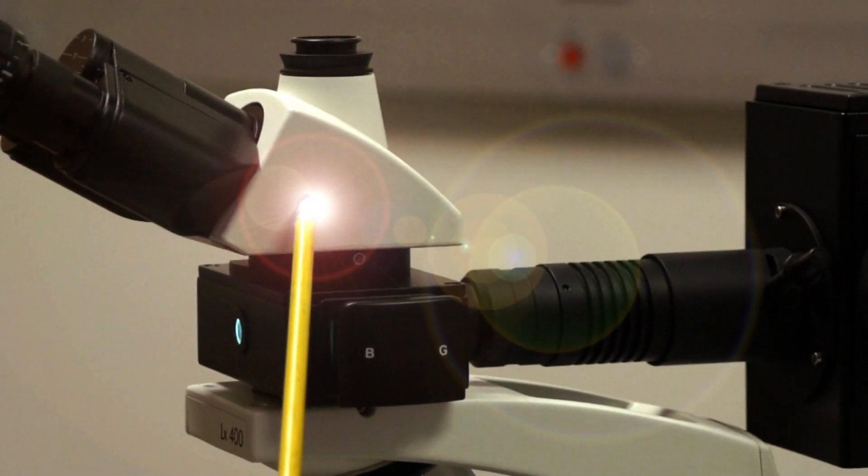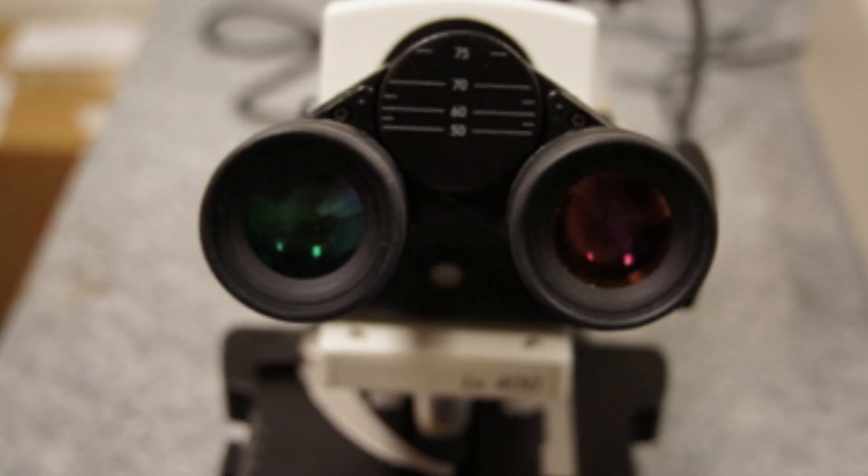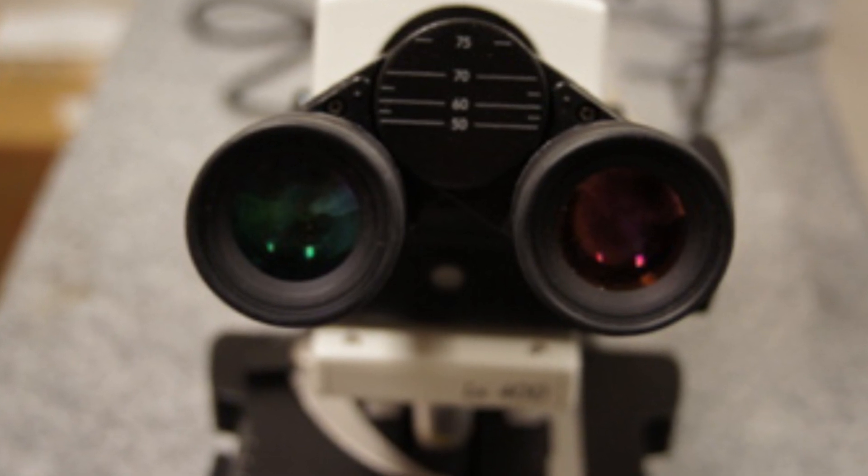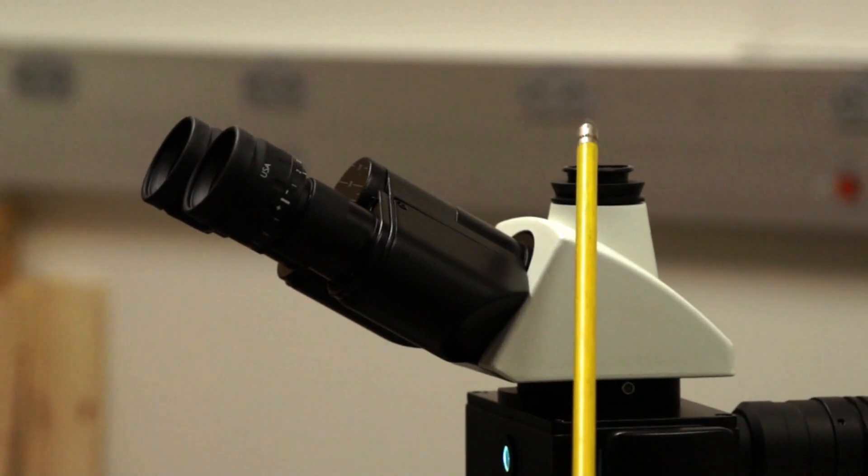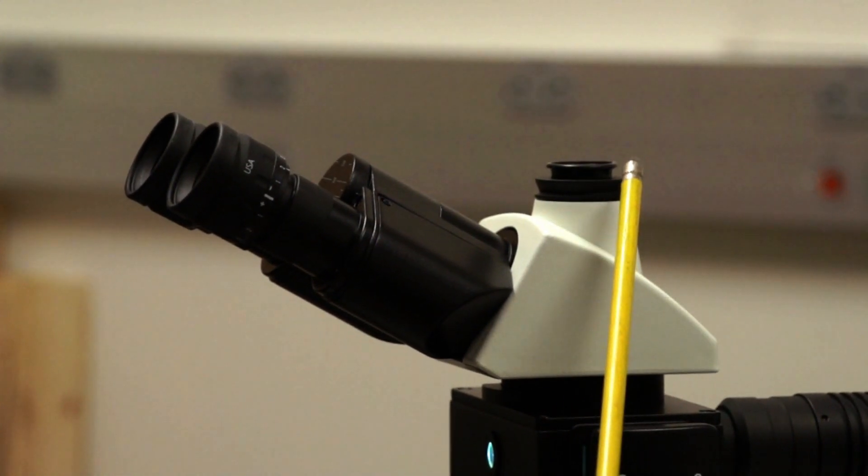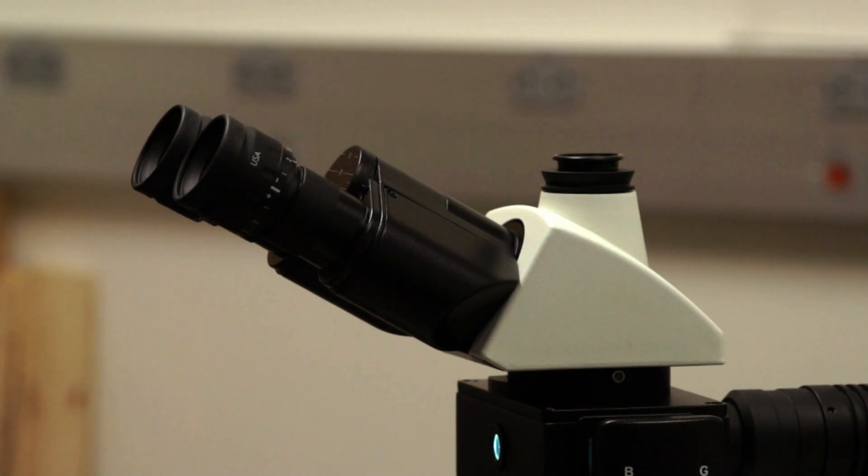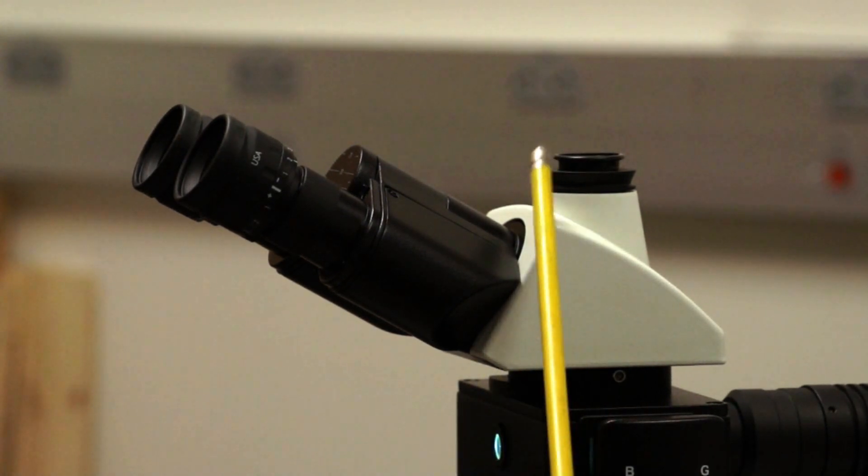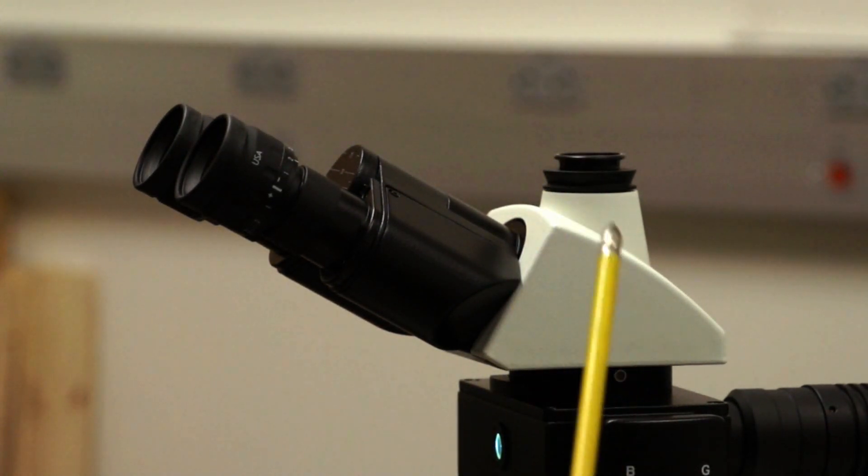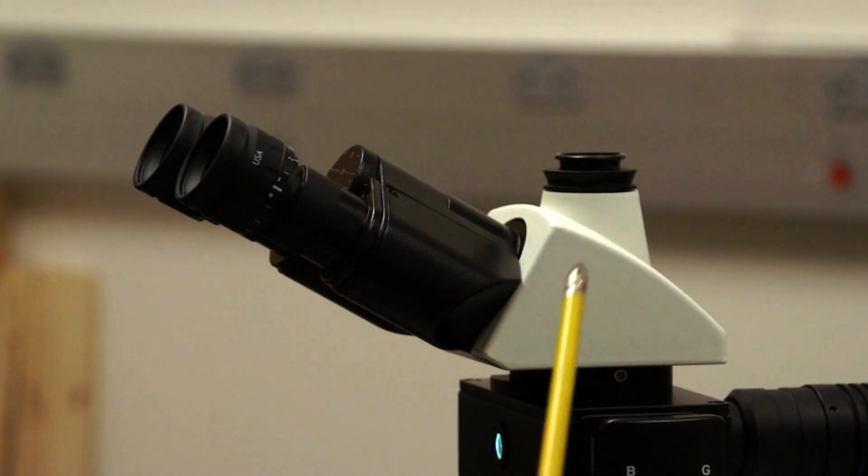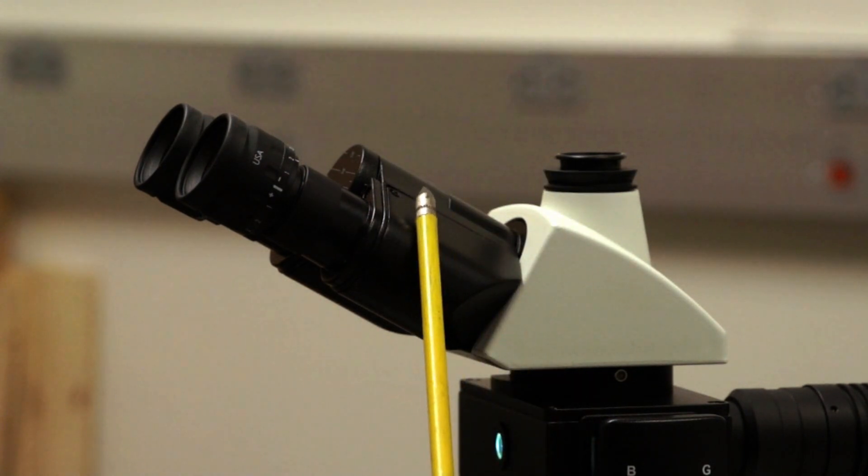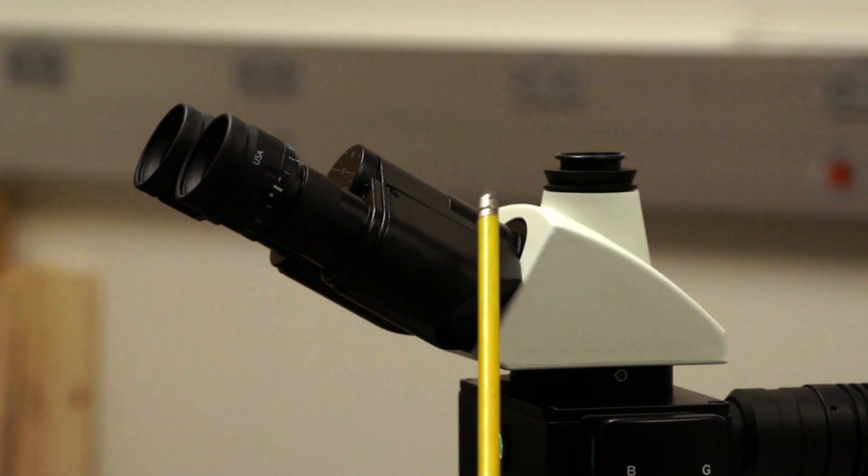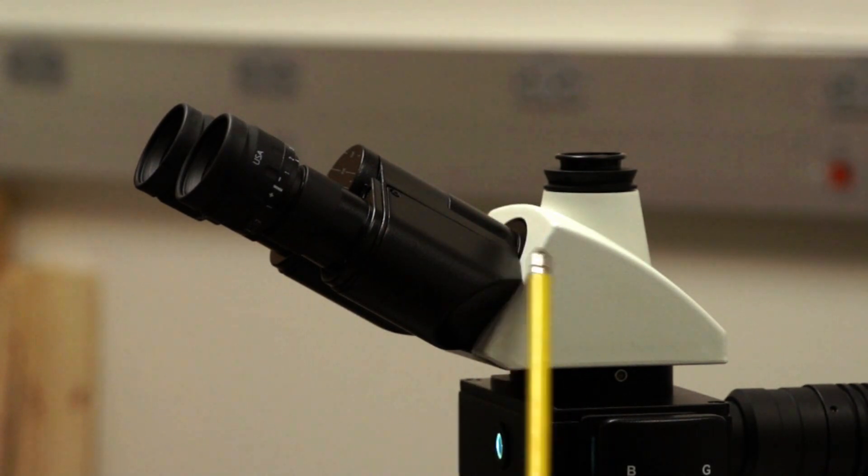It travels through the nose piece and up into the head of the microscope. This is called a trinocular head because you have two eyepieces for viewing and a third port to which you can attach a camera. Historically we've used film cameras on the trinocular port, but nowadays with the advent of digital microscopy we can put digital still cameras on the microscope or also video cameras which record live motion in living cells. We also have binocular tubes and you may have seen monocular tubes in the past, but this one is called a binocular tube or head.